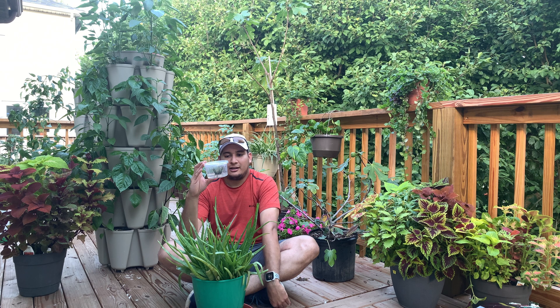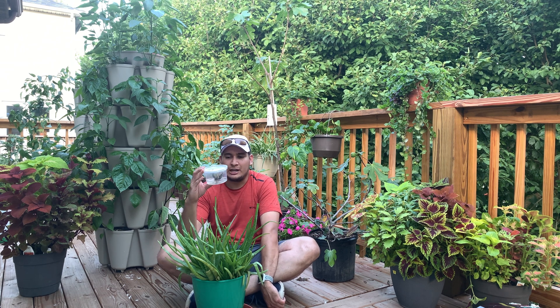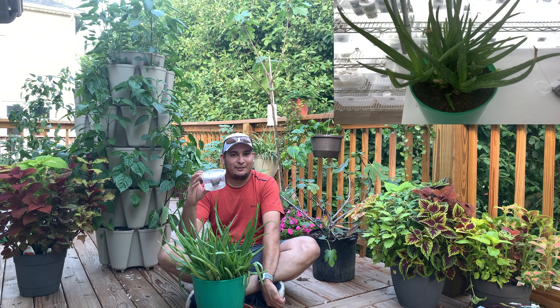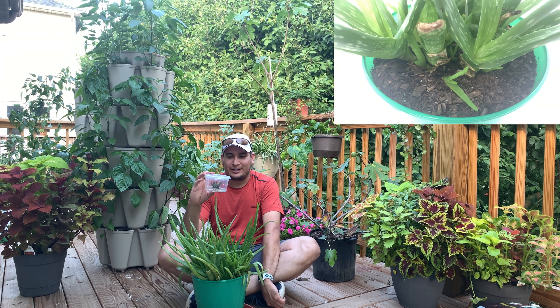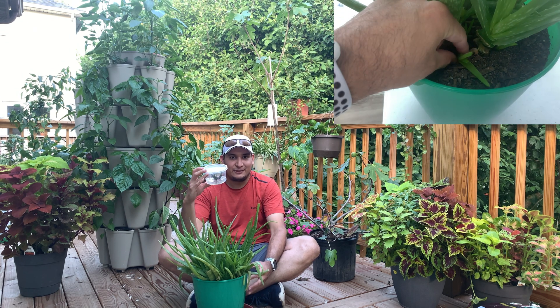With other plants, especially the ones that are outside like this one, you get a lot of issues with fungus and bacteria. But with this one I never got any issues. So it has done very well — it was probably one of the easiest plants I have ever sterilized or introduced to tissue culture.